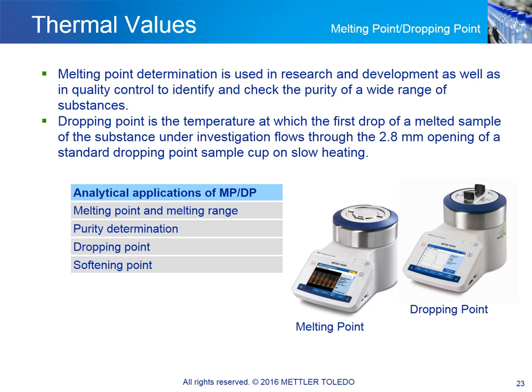The melting point instrument determines the temperature at which materials change from the solid to the liquid state, that is, their melting point. If the transition is not sudden, but happens over a certain temperature region, the effect is also called the melting range. The measurement can be performed with up to 6 capillaries at the same time, allowing either duplicates or several materials to be measured in one experiment.